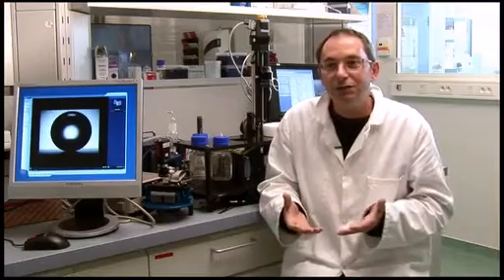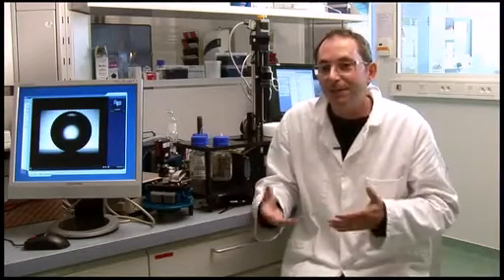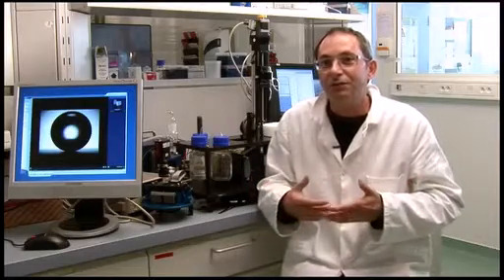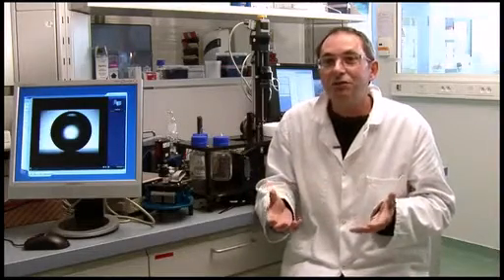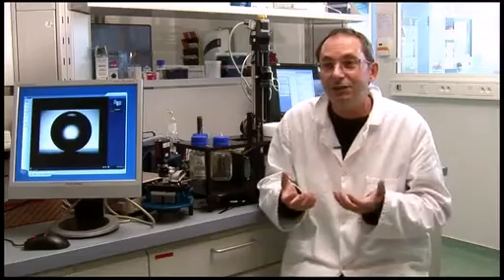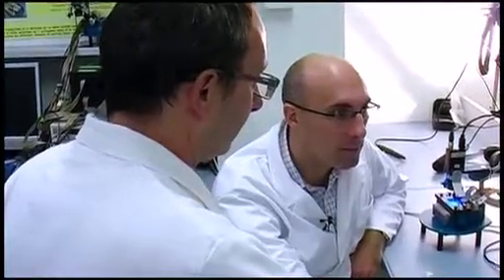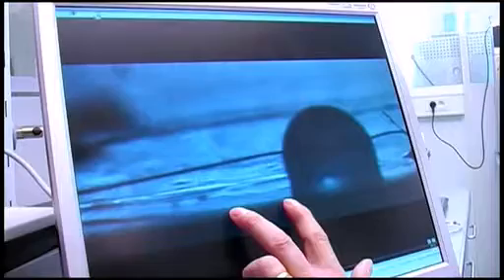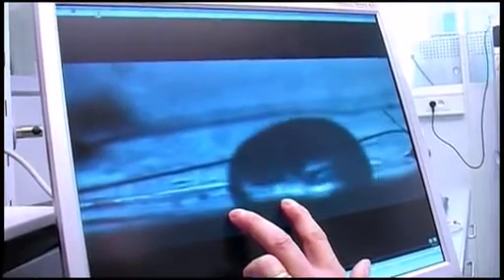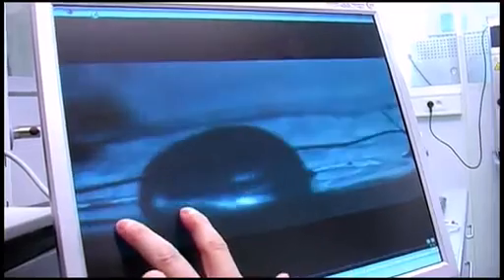On est tombé sur des difficultés pour manipuler les fluides à cette échelle-là, pour connecter l'ensemble. On s'est dit : trouvons une autre solution. L'idée a été de supprimer les canaux et de travailler directement sur les volumes fluides. Et grâce à l'électrostatique, on a pu effectuer cette fonction en exploitant le phénomène appelé phénomène d'électromouillage, qui consiste à modifier la mouillabilité d'une surface. On a une électrode, et quand j'actionne cette électrode, la goutte vient ici ; j'actionne celle-là, la goutte vient ici ; j'actionne celle-là, la goutte vient ici.